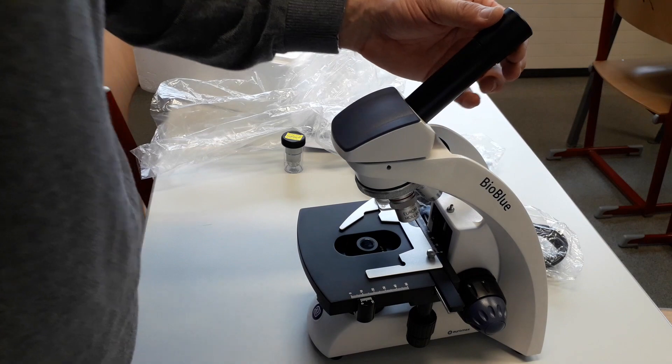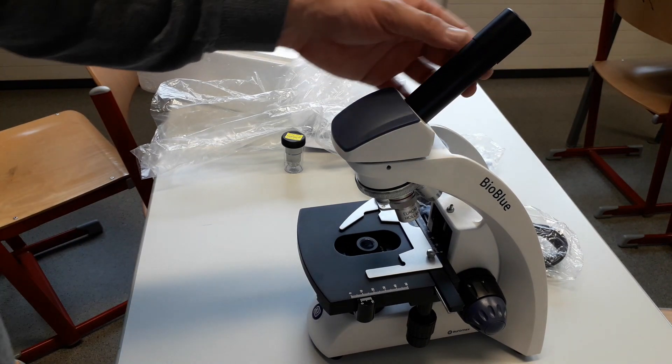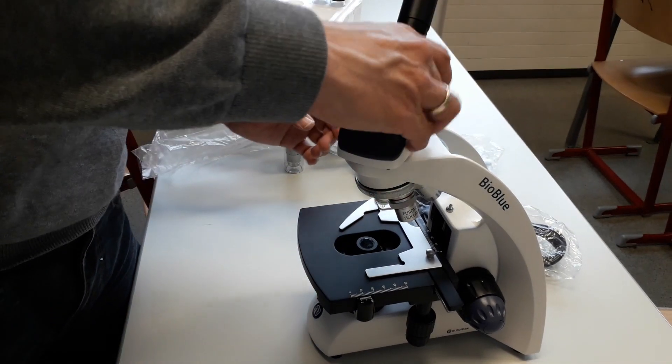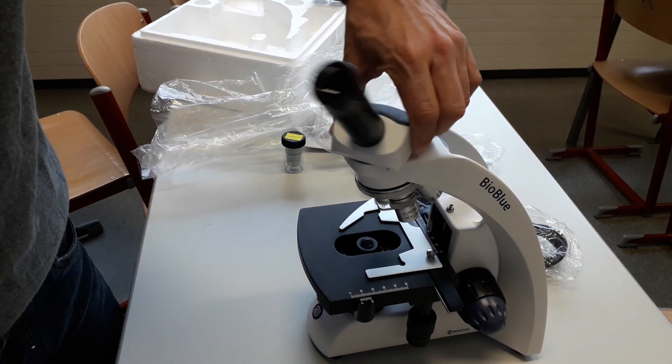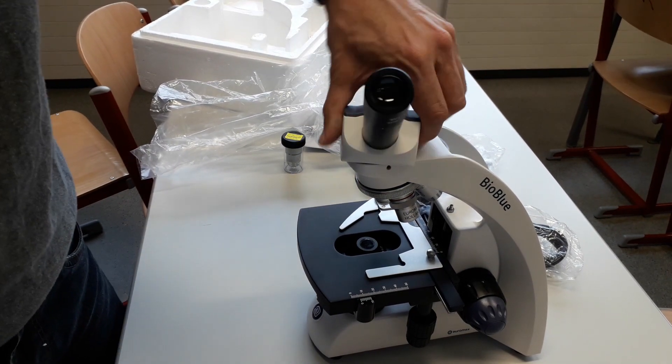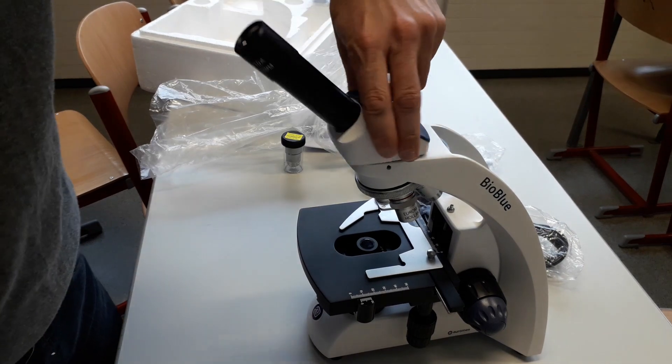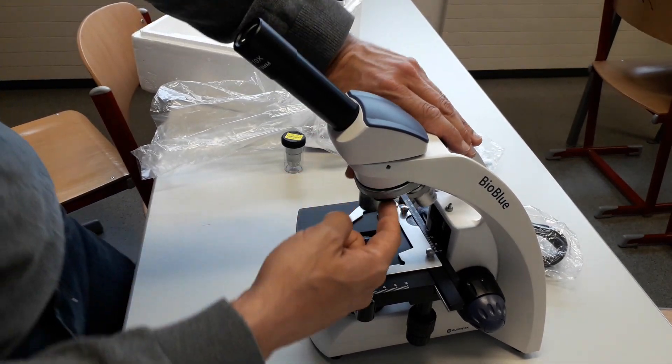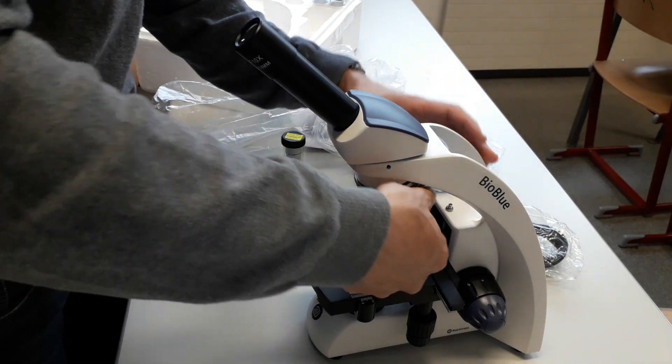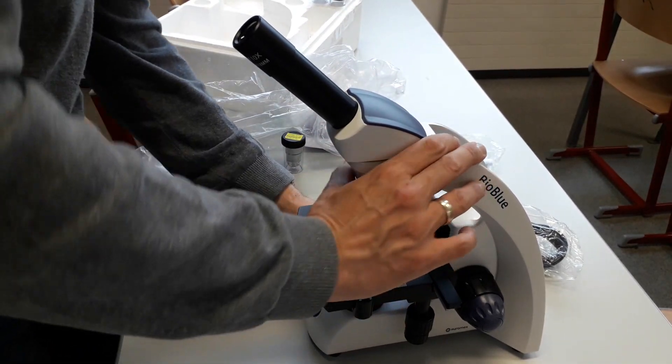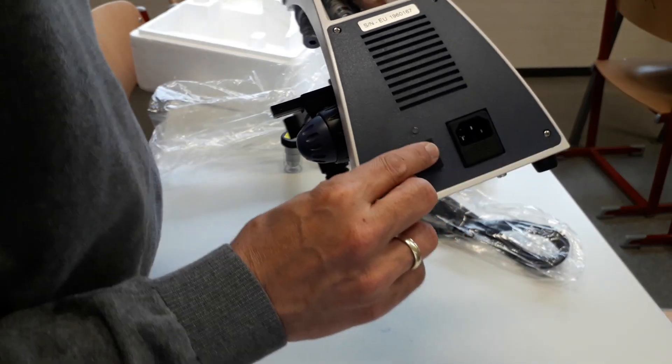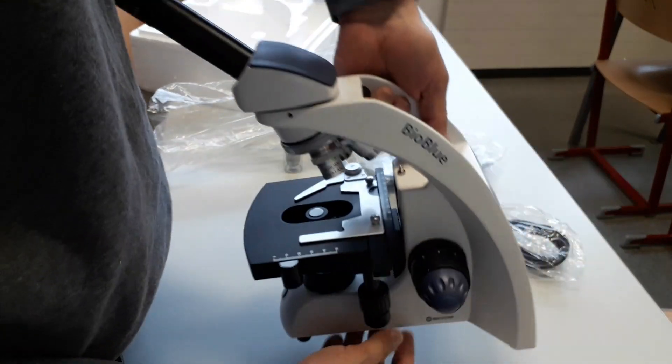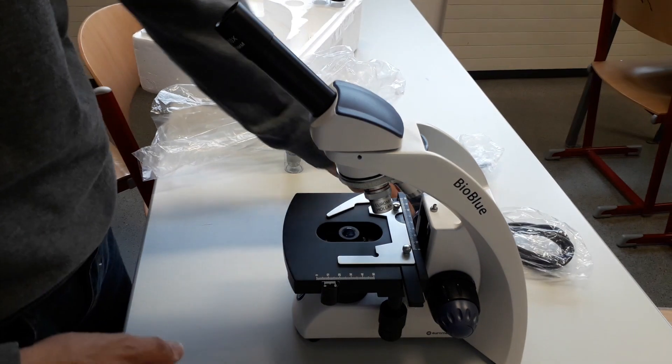This one here can be turned. There is a little bit of resistance, but not too much. Very nice. It goes very smoothly. There is the possibility to attach a fourth objective. I like it. Where's the main switch? The main switch is here in the back. So that's basically the first one.